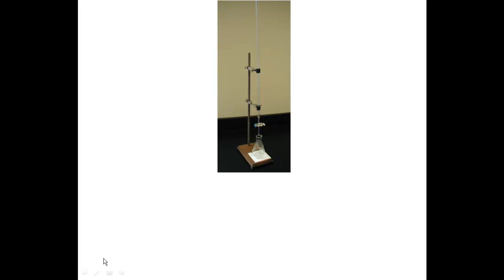Okay, the setup for titration processes: you have your burette. You've got to have a ring stand to hold the burette, and you have your Erlenmeyer flask at the bottom there. Typically that Erlenmeyer flask is where we have the analyte, and in the burette is where we have what we call the titrant.